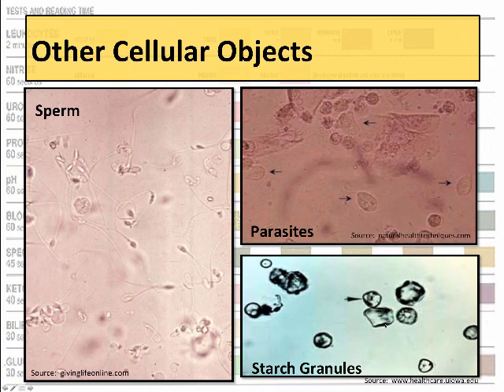And these are starch granules. Now, this is not something that likely came from the urine specimen. It probably came from maybe the gloves that the tech was wearing while performing the urinalysis. It may have gotten in there. Perhaps there were some on the slide. But the reason I'm showing it to you is because it does sort of resemble red blood cells. And so in that case, or just cells in general, you need to be able to go, it looks like a cell, but something's wrong with it. Something's off. Let me take a closer look.